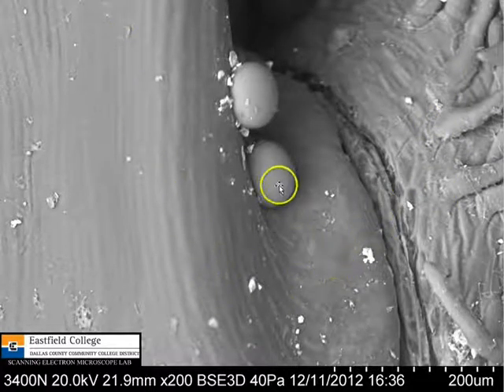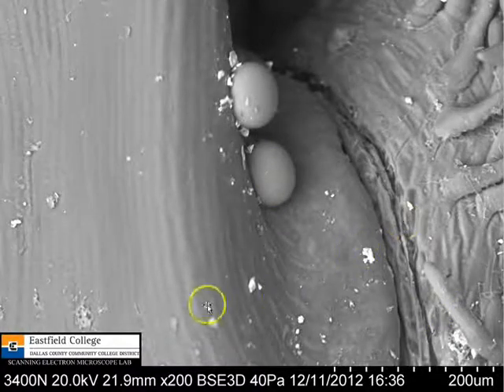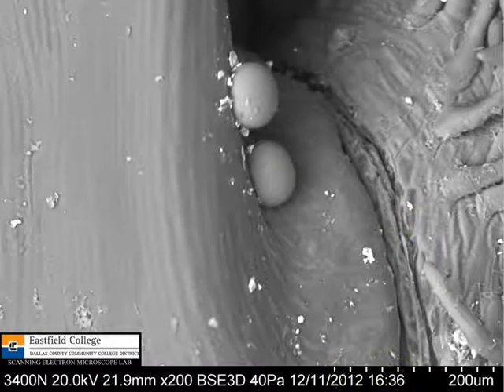This is actually the pine needle, and you can see those little drops of sap attached there. And just like we told you in previous webcasts here, the bright things are just dirt. The dirt seems to glow when you put it in an electron microscope.